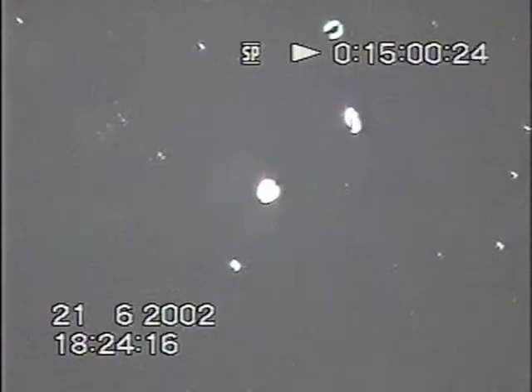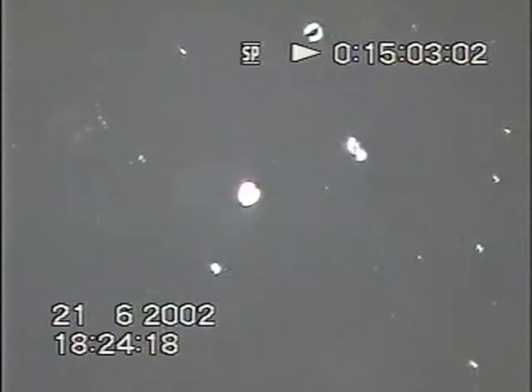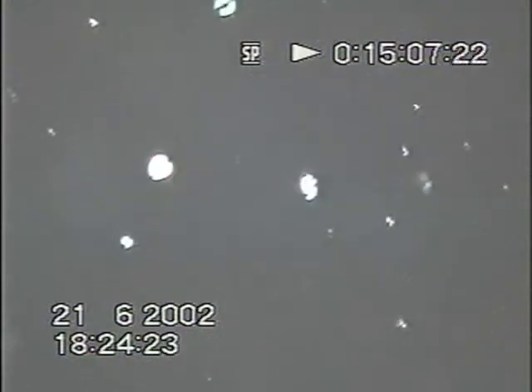It really is full of life. I've used the DIC at its maximum advantage here, so it's more or less dark field illumination. You can see the flagellae, or is it the mouth part? I don't know what is going on. It is like a rotifer.